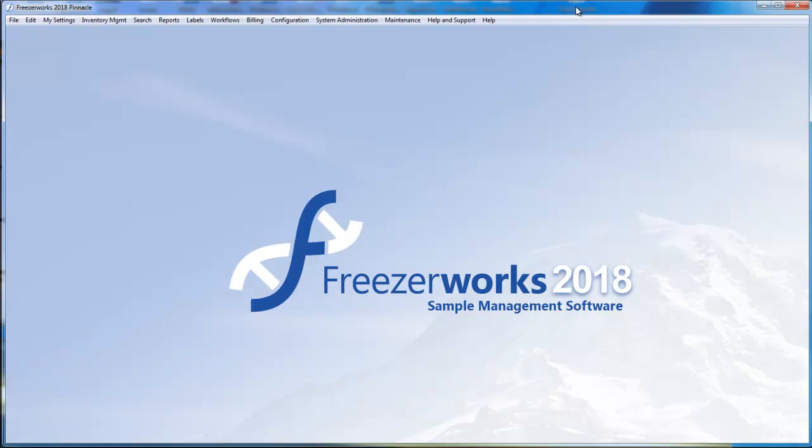Welcome to part 2 of our look at Freezerworks Pinnacle. Last time, we glossed over the entire study management process, starting with study configuration. Let's dive into that now. I'll show you how to configure a study with multiple arms and assign it contacts, sites, and security settings.